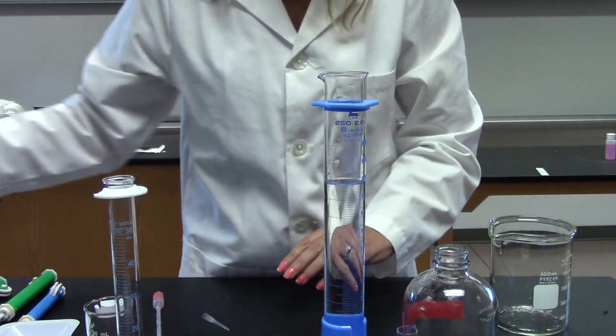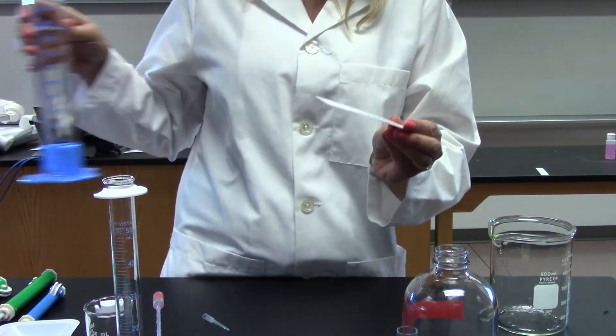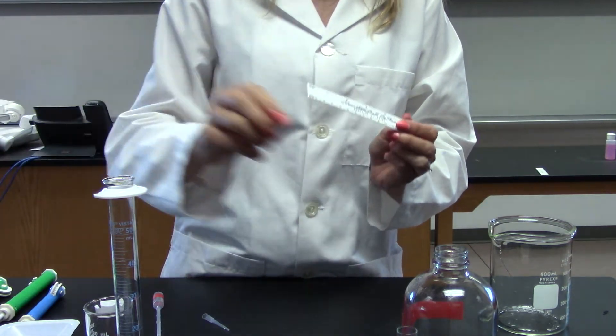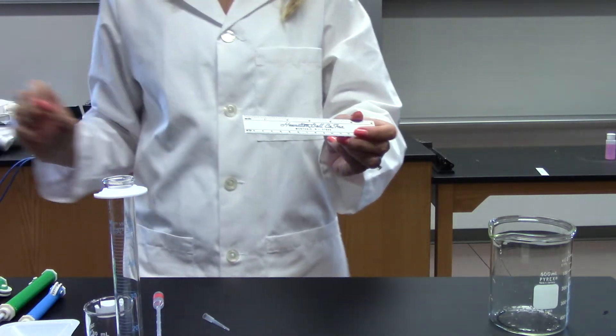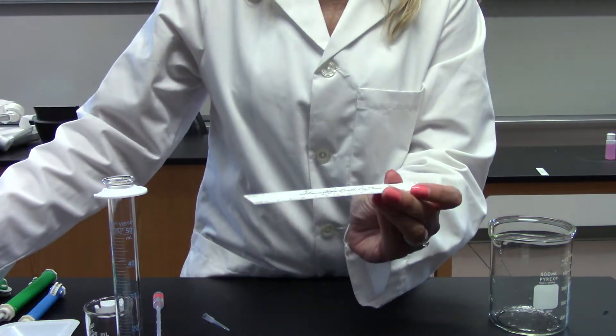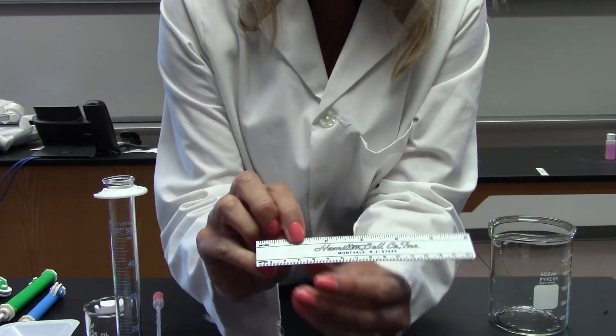Now I want to quickly show you a metric ruler. It's important to understand that in this class, we do not use the inches on any ruler. We're only measuring in meters, centimeters, and millimeters. So ignore the inches at the top and go to the part down here that says metric.